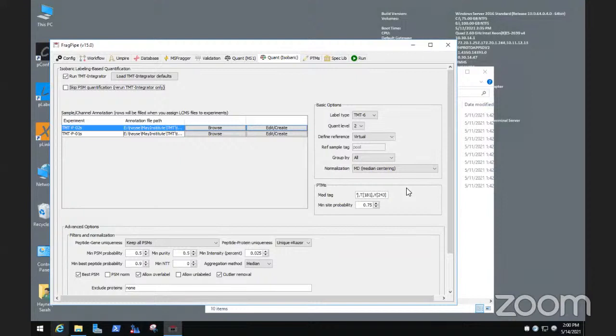You could also do an open search on top of the default TMT workflow, and you'll pick up those underlabeled cases on lysine as a negative mass shift of the TMT label, for example, and so on. So there are several ways you can quickly do that, but we don't have a QC tool that will automate it for you at the moment. It's probably a good idea to add it.